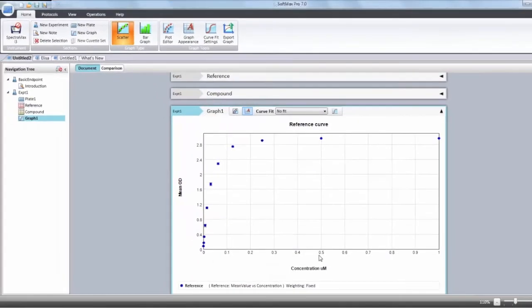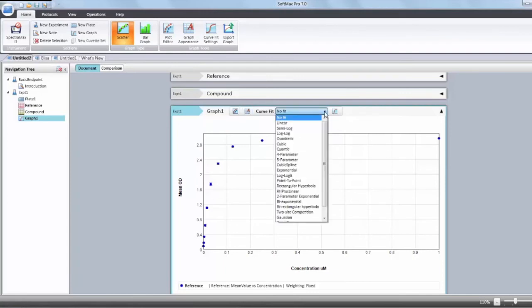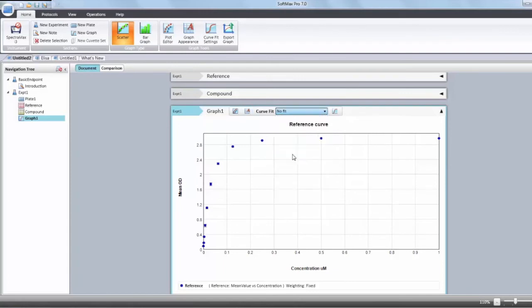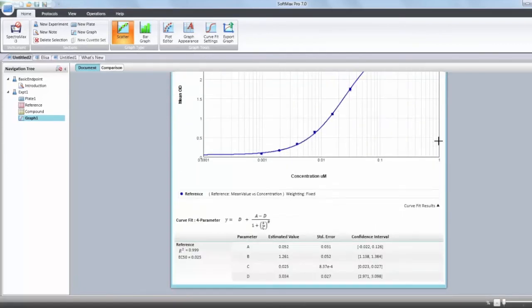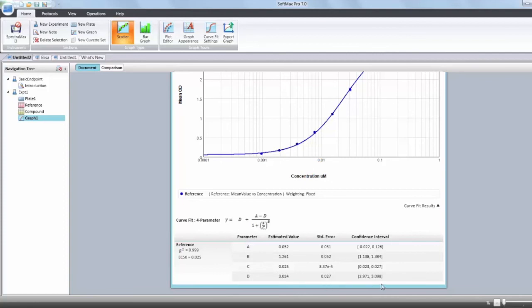Finally, we're going to be able to change the curve fit. We have 17 curve fit to choose from and for that curve fit, we're choosing the 4 parameter curve fit. Below the graph, you see that you will have all the parameters describing your curve, their confidence interval, the r-square and the EC50.